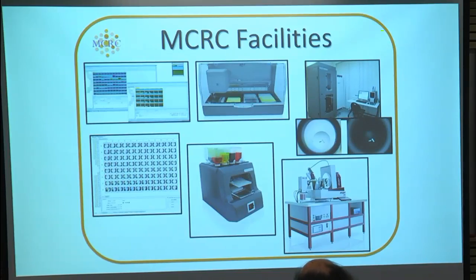If we see an initial hit that shines in the UV camera, and we see it on the website, we take it to another robot that we have, which is called the Formulator, and it does an optimization of the crystallization screens, which is also very convenient. It can do both 96 well plates and 24 well ones.